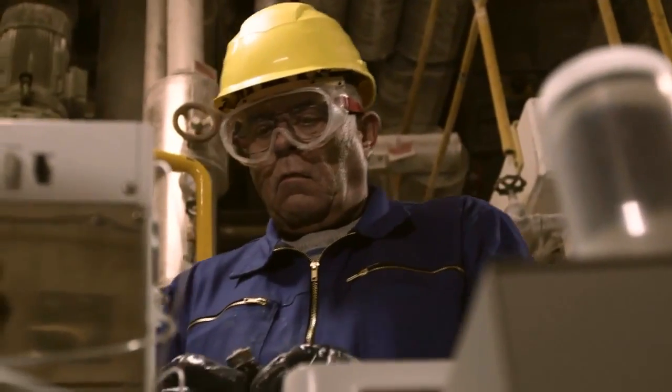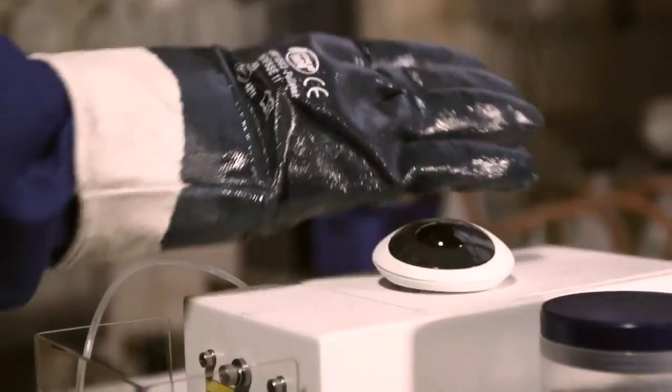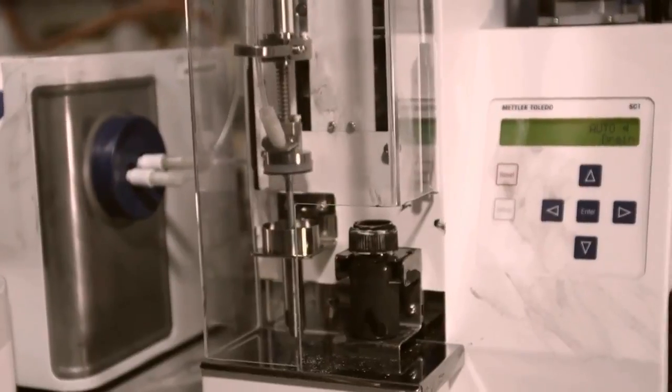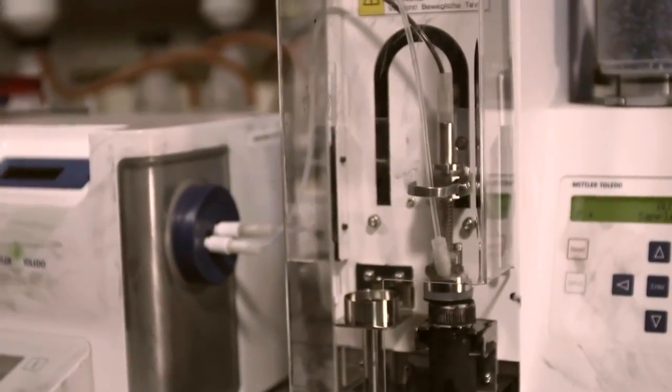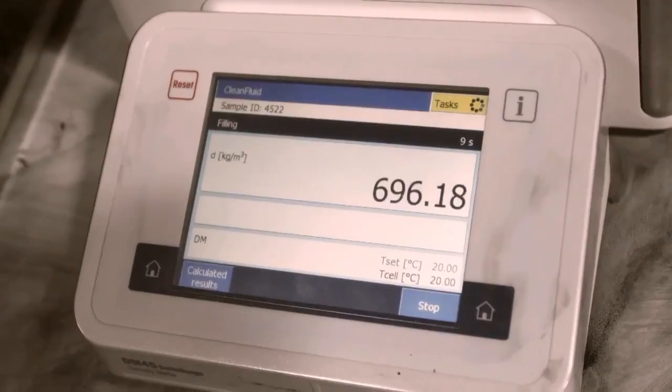With ErgoSense and powerful automation, the operator can avoid direct contact with aggressive and toxic chemicals. A simple hand movement is all it takes to determine API gravity or concentration of a liquid.